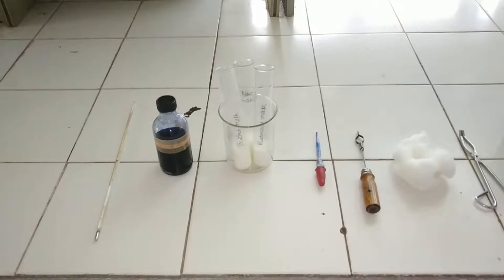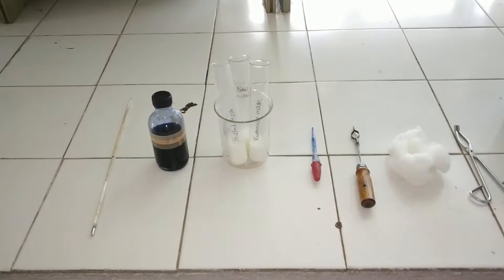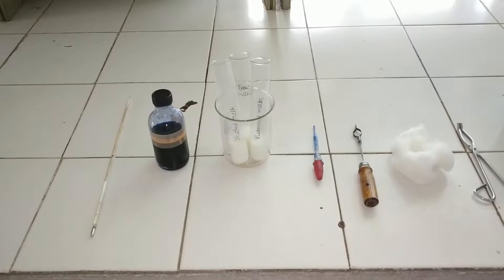Hello friends, today we are going to test the quality of milk samples by methylene blue reductase test.